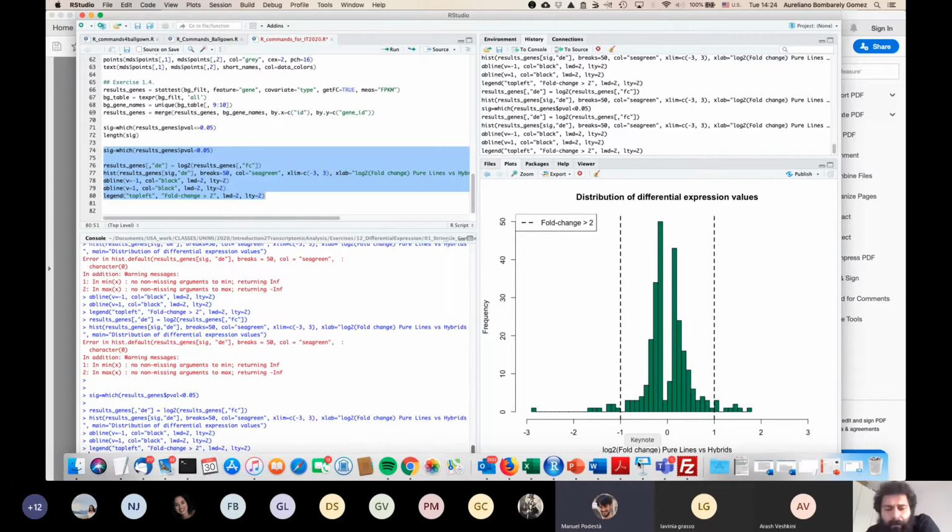I'm sorry, this graph actually represents non-adjusted p-values, so multiplicity is not taken into account here, right? Yeah. Okay, and you can still do that and present the results, or do you usually have to use q-values instead of p-values? I'm a little bit confused about when you should use p-values and q-values. You always should use q-values, except that using q-values doesn't give you a differential expression.